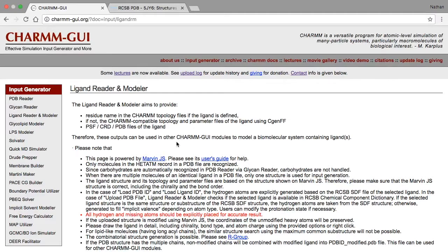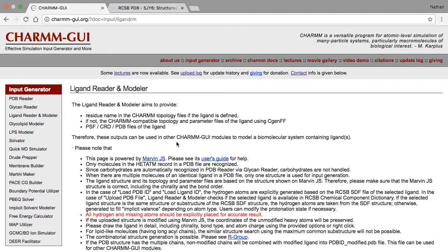In the previous video, we demonstrated how to create a molecule by drawing the atoms and bonds manually with MarvinJS. In this video, we'll show how to read a ligand from a PDB structure.